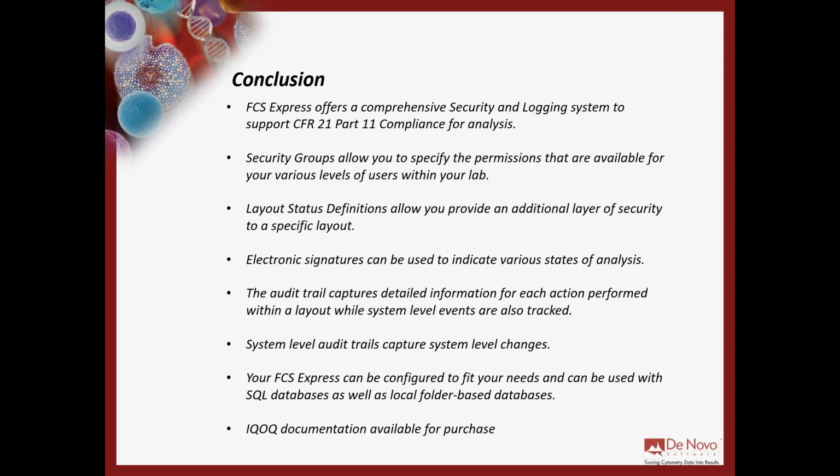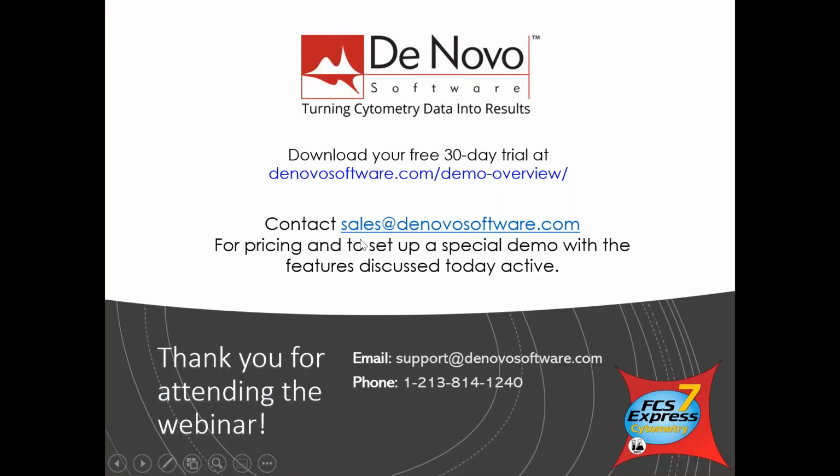So keep in mind also that FCS Express can be configured to fit your needs and can be used with SQL databases as well as local folder databases. And we encourage you to reach out to us and we can help you figure out what you need in terms of SQL databases, what you need for number of users, what you need for add-ons. And eventually, once you have this implemented, or even if you just need IQ/OQ, we have that available to go through pretty much just about every action that you could perform in software in a guided way.